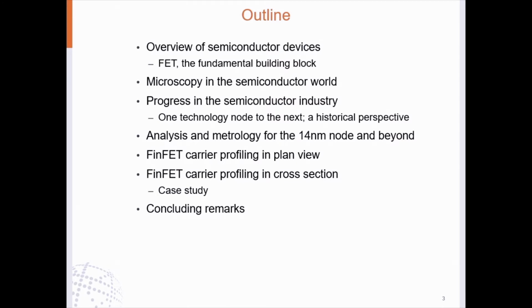So I want to talk a little bit about the field effect transistor, and then a little bit about microscopy in the semiconductor world. Virtually everything in semiconductor design, fabrication, and analysis is done under a microscope, and that microscopy has had to evolve rather aggressively to try and keep up with the advancement of the technology.